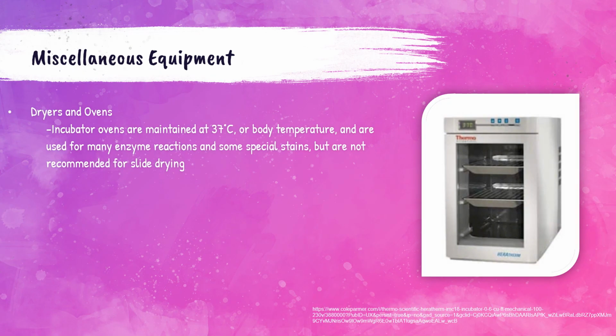Incubators are maintained at around body temperature, which is 37 degrees Celsius. These are used for various enzyme reactions and some special staining applications. It is important to note that these incubators should not be used for the purpose of drying slides.